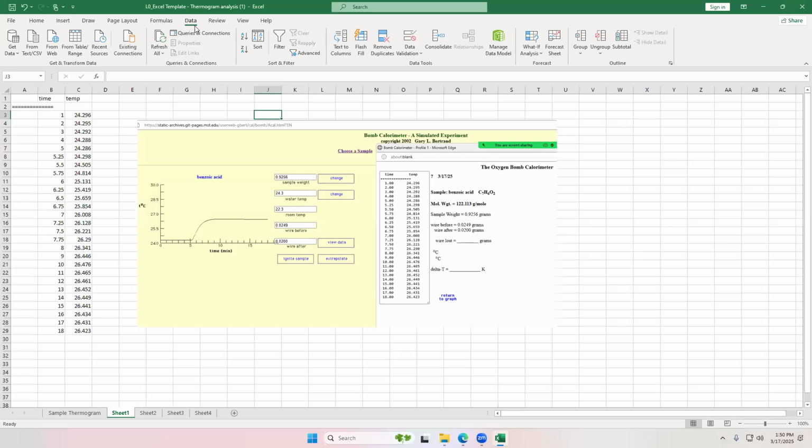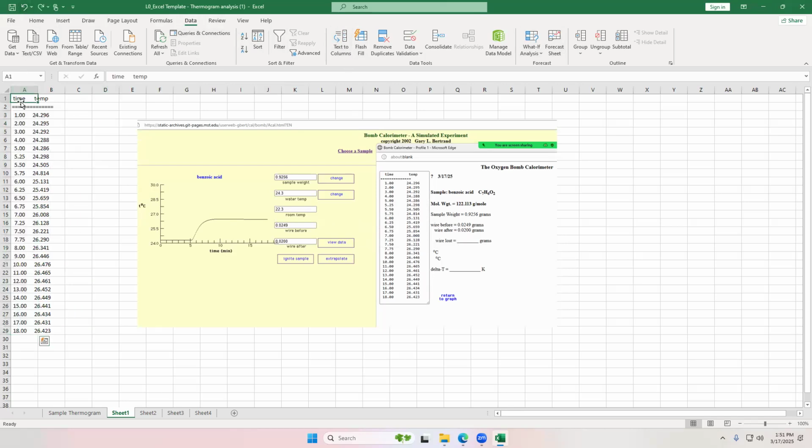Yeah, click on data, highlight the data that you want to split up into 2 columns, then click on data, text to columns. This one tells me I don't have anything selected. No, you just highlight the whole set. So highlight everything, unless it's already been split by Excel for some reason. Sometimes it's smart enough to figure it out that way.